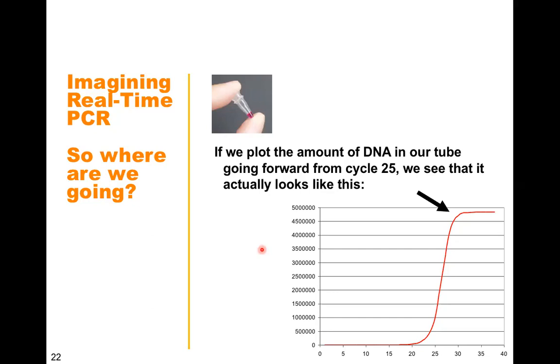Now what will happen in case of treatment, where the cycle is 23? Again, one is 28 and the other is 23, so the difference will be 5 cycles. And the calculation will be 2 raised to power 5, so that is 32. So a 32-fold change will be there. We can say that in case of cut margin there is a single copy, in case of cancer there are 8 copies, and after giving treatment there are 32 copies. So this is how the data is basically used in clinics, where we can directly correlate with the number of copies.